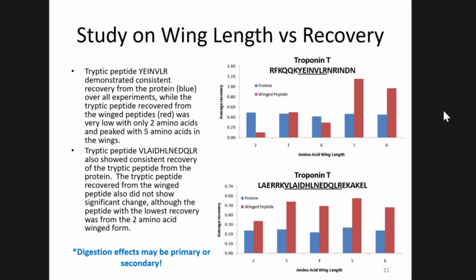Yeah. So wouldn't adding amino acids to the length of the peptide affect peptide synthesis? Because after a while, you have a really huge peptide. Yeah. For synthesis, I guess after trypsin it comes back down to a small peptide. Run it, it's great, but for synthesis, it starts becoming a problem. Yep. That was one of the drawbacks, the synthesis. Once they get beyond a certain length, the synthesis recovery is not quite as good. You might have more truncations or under-synthesized peptides in the sample, and solubility.